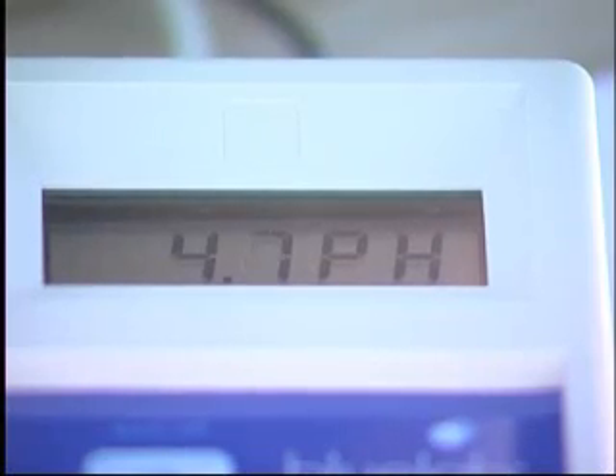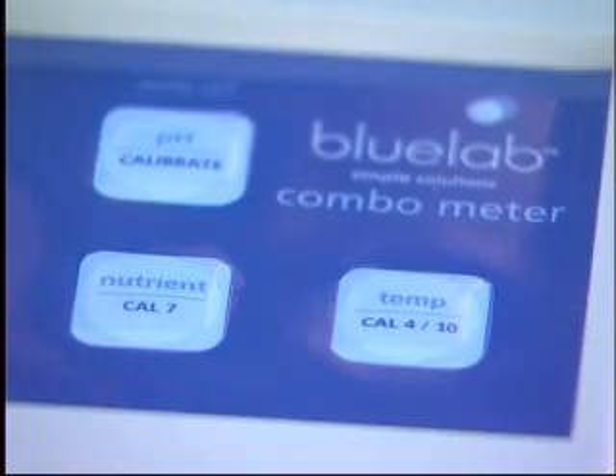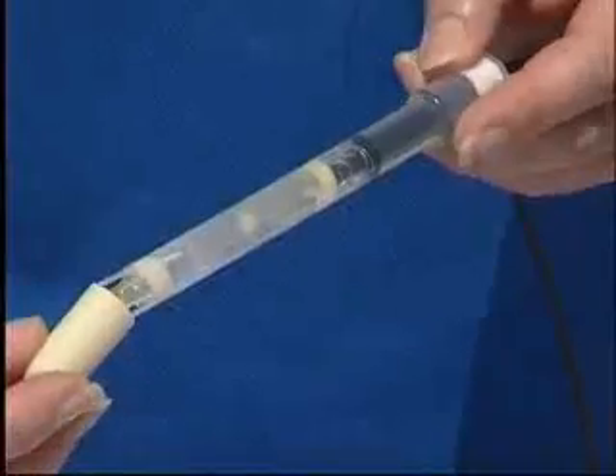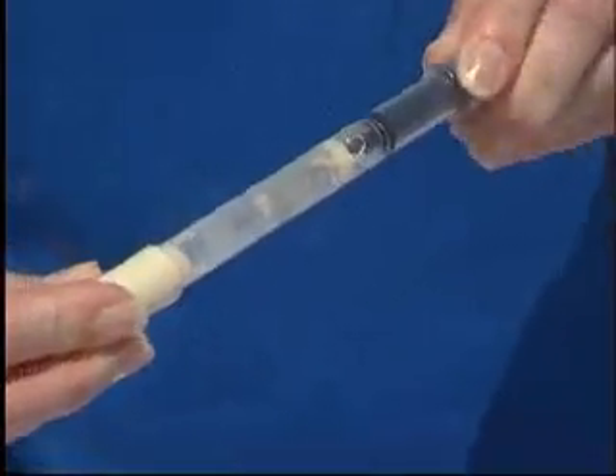When the measurement stabilises, press and hold the CAL4/10 button until the on-screen display flashes. Release and press CAL4/10 once. A steady 4.0 or 10.0 will be displayed. Rinse the probe in fresh water and replace the storage cap. The unit is now completely calibrated.